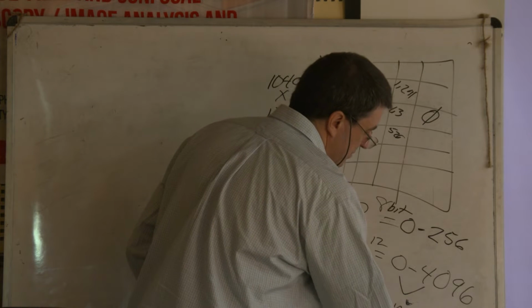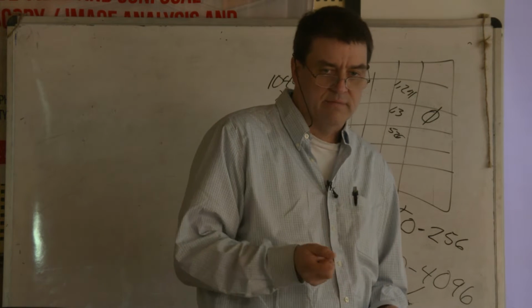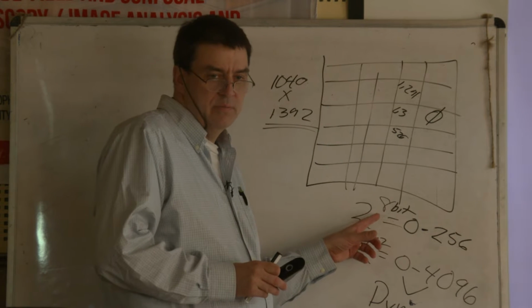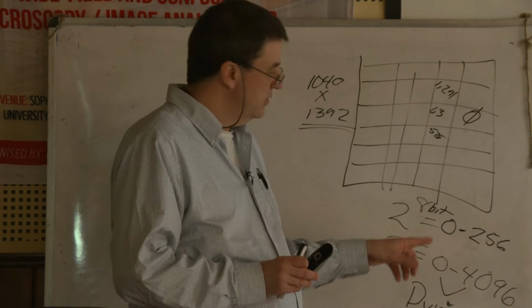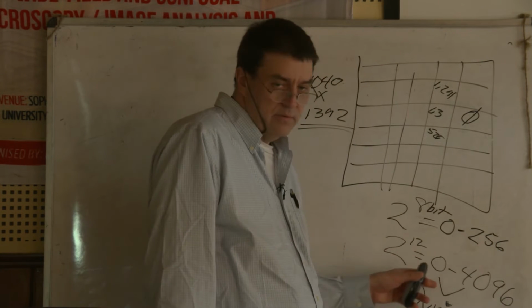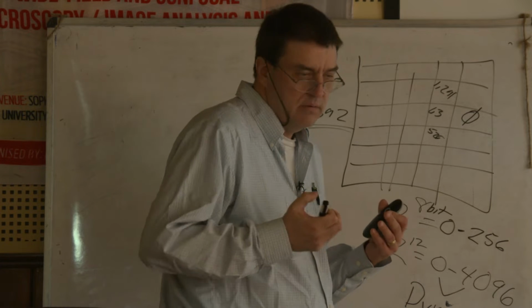If you want to publish in modern biology, if you want to publish something quantitative, you need to work in 12-bit. If you work in 8-bit and send this to a journal, they'll say it's not going to work. You need to at least work in 12-bit, okay? All your data will have numbers in this value because it just allows more information. You could pull out more detail.